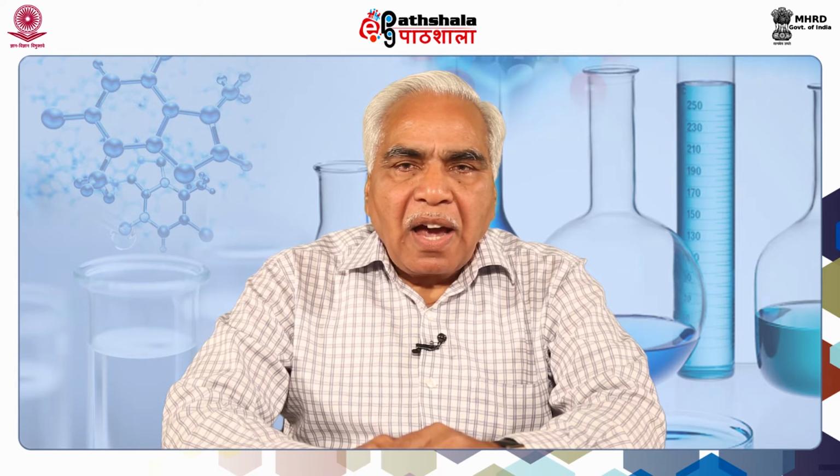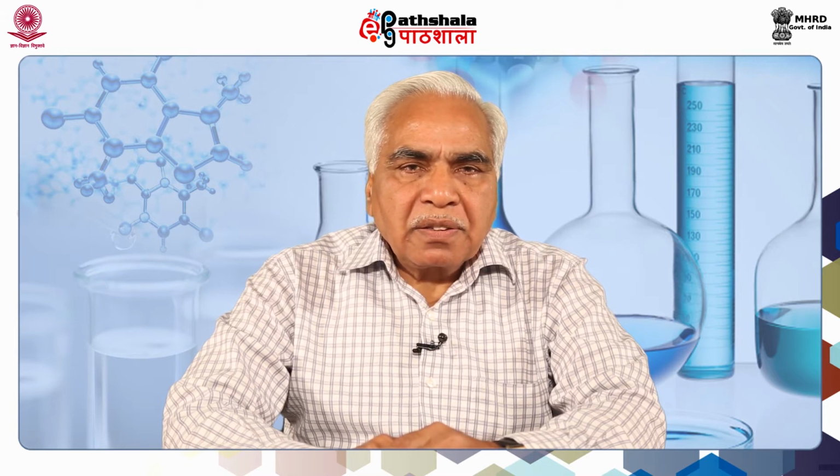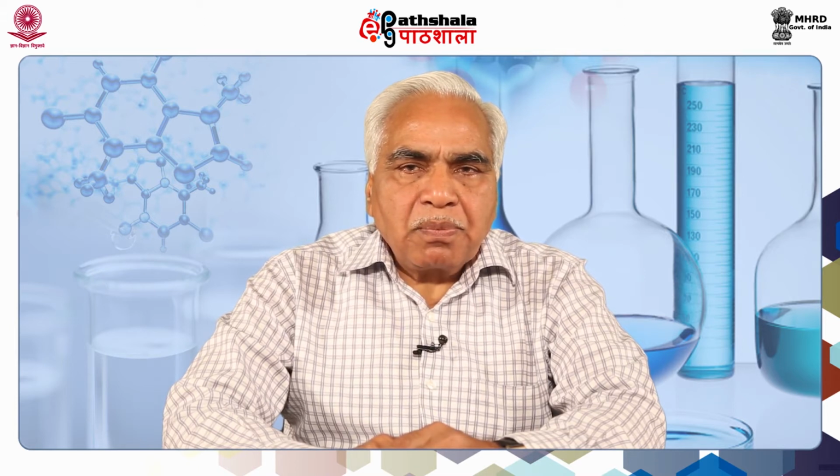Today, I am going to teach you about the scanning electron microscope. The scanning electron microscope is a powerful microscopic tool developed by Dr. Charles Oatley.